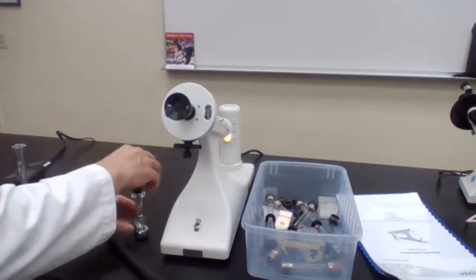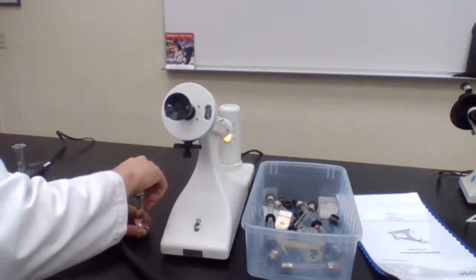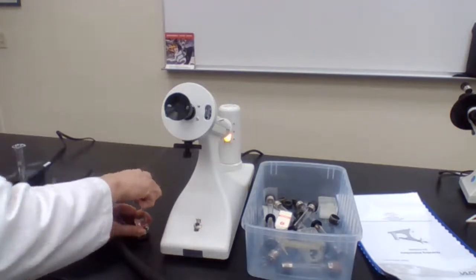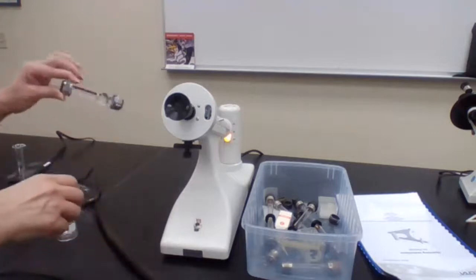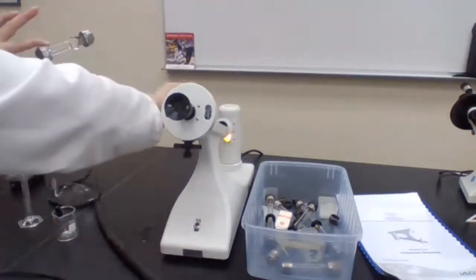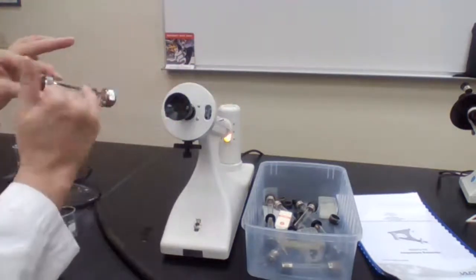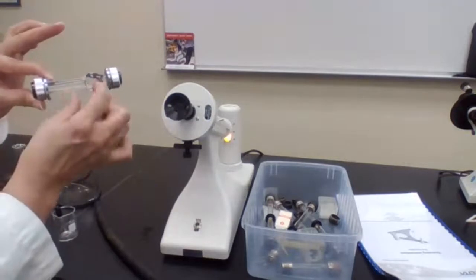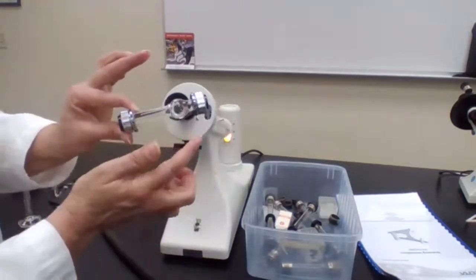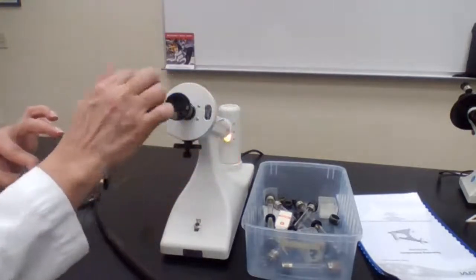Okay. When I place the cell inside the sample holder tube, the light is going to be rotated based on the purity of the sample I have in this solution, and I can record the observed rotation.